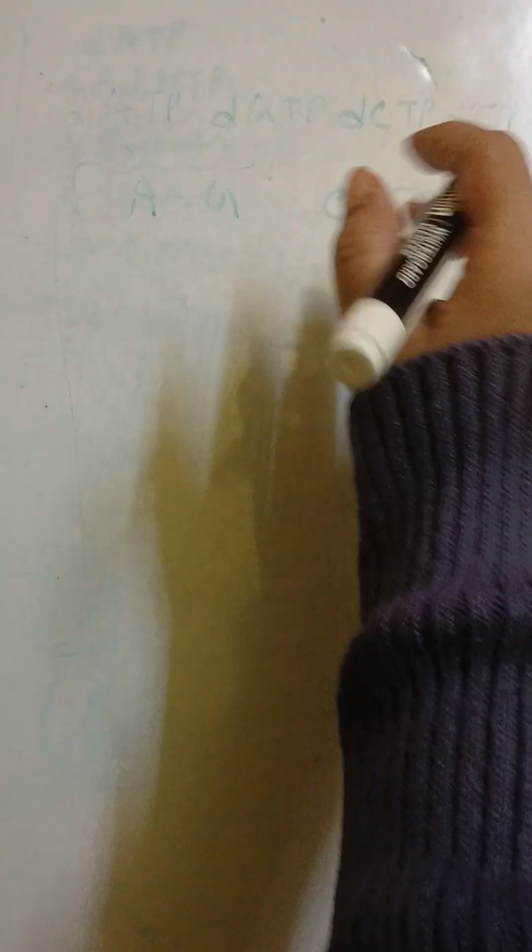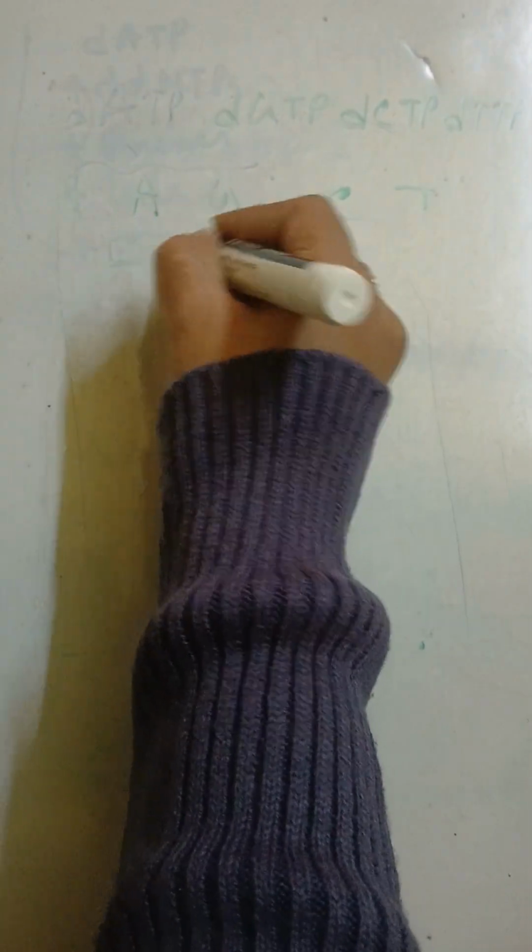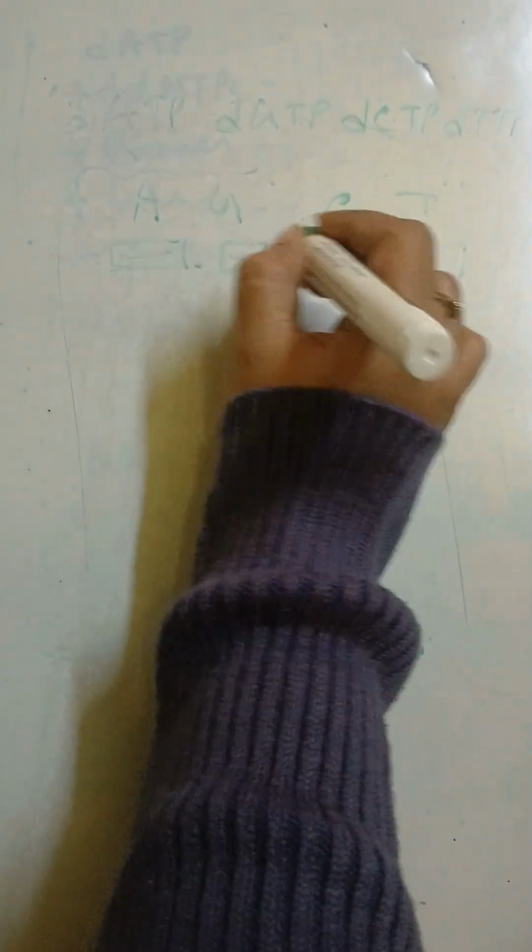So from the different reaction vessels, you will pick up your reaction mixture and put it into the sequencing gel wells. Further in the RDT classes, you will learn how to prepare the gel, not the sequencing gel, but how you will prepare the gel for a gel run after PCR or DNA fragmentation and all. In this way we will learn how to prepare the running gel buffer and all, and what the well is that I'm telling you about here.